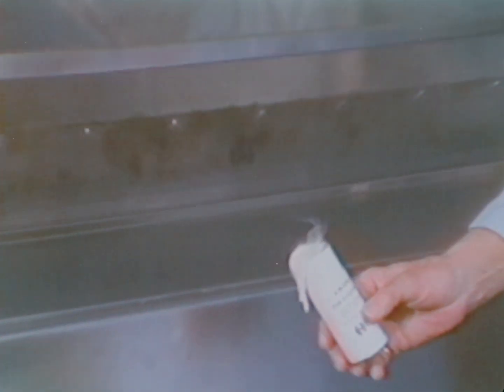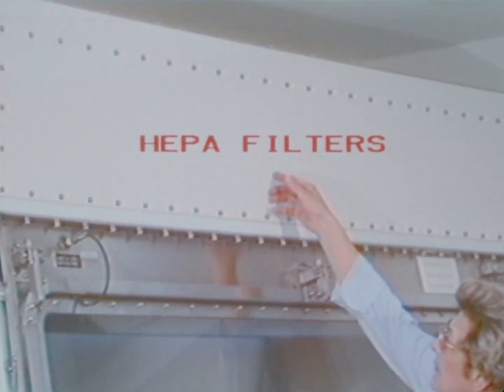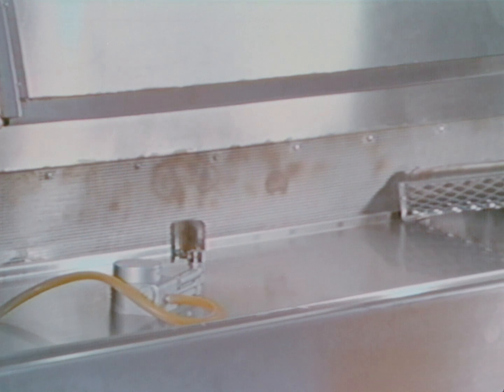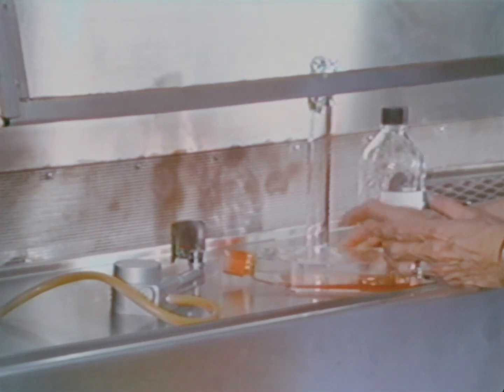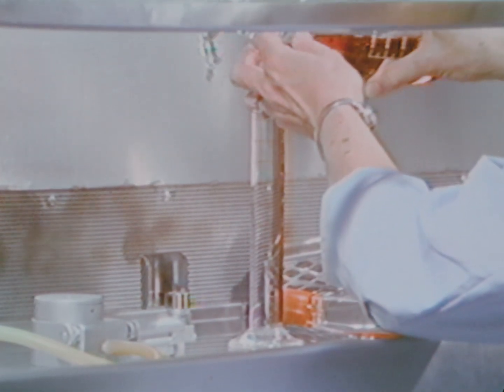Air drawn into the front opening of the laminar flow cabinet is equal in volume to that exhausted. The exhausted air goes through HEPA filters prior to discharge into the room or an exhaust duct. Ideally, however, the cabinet exhaust air should not be recirculated. To ensure protective functioning of the laminar flow cabinet, place equipment and supplies in the cabinet before beginning work. Make sure that intake and exhaust grills are not covered. Even when working in a cabinet, you should practice aseptic techniques. Since much of the air is recirculated, heat can build up. For this reason, use open flames as little as possible.